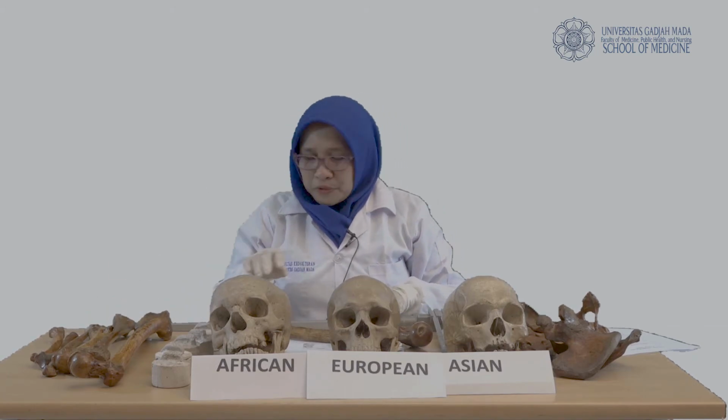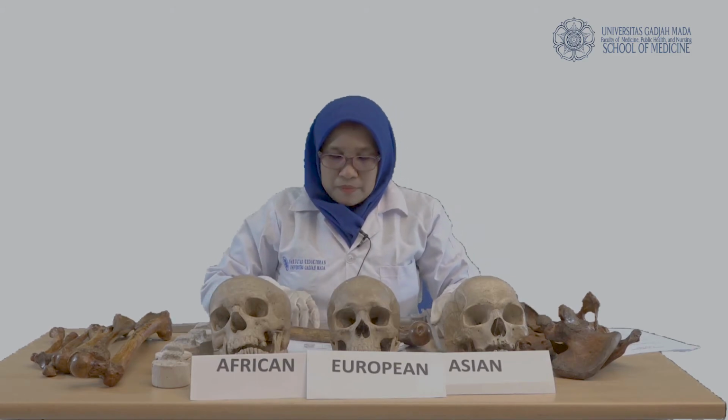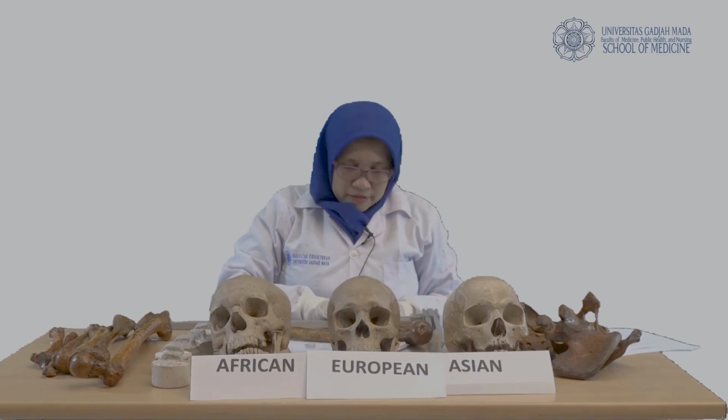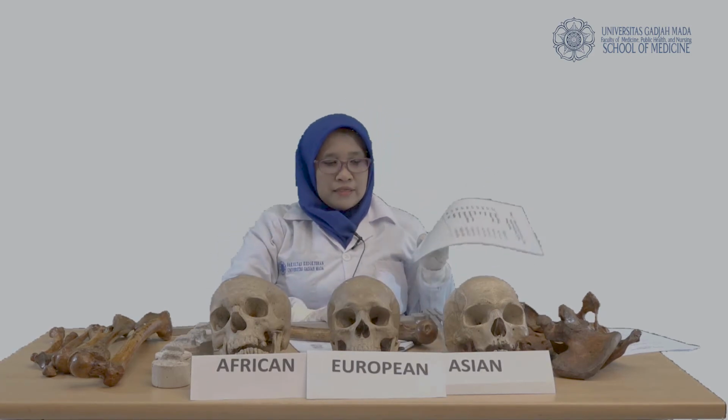Then how to do the estimations? We will measure the long bone first and then use the formula to calculate the estimation of the height using this table.